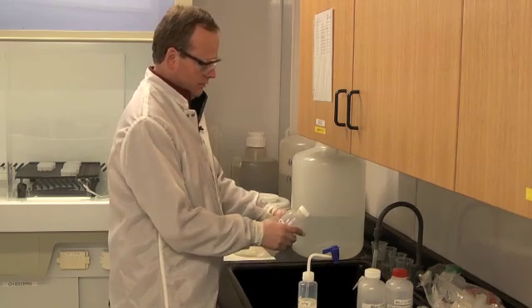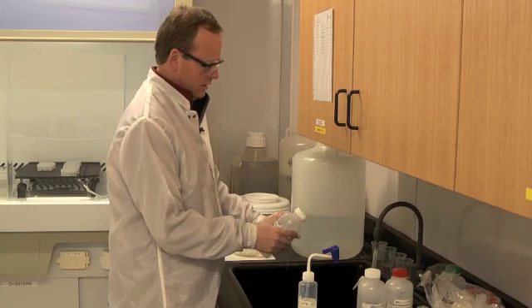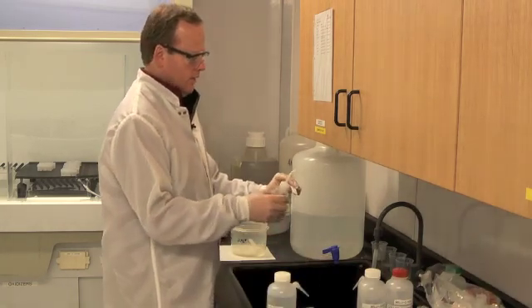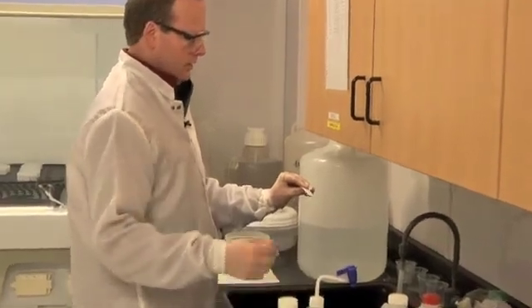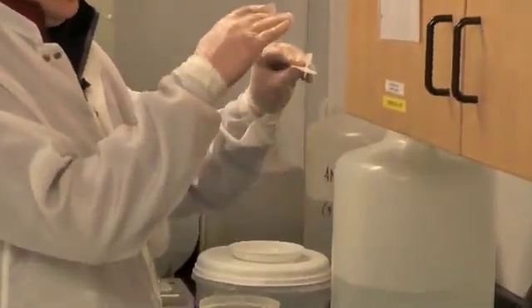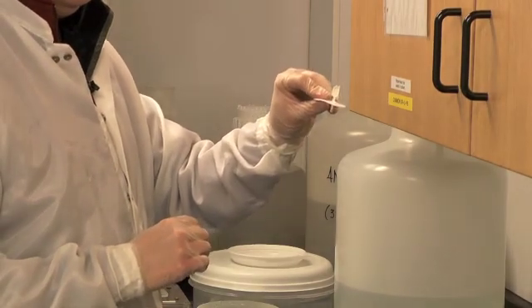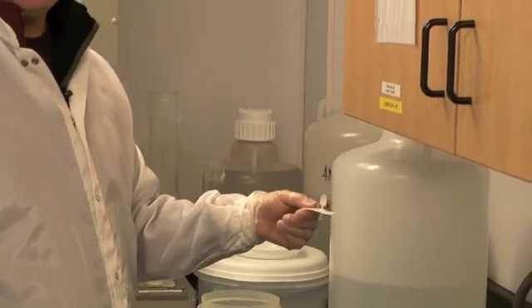After we've rinsed the column, we're going to fill the stem with water and then slurry a small amount of our ion exchange resin into the reservoir. That resin will settle down into the narrow column portion and we're going to set it on a stand over here under the hood for further cleaning.